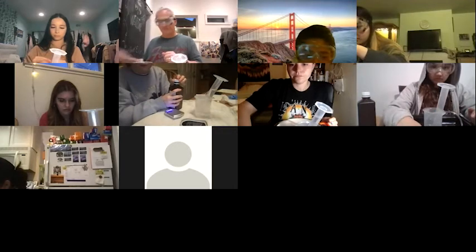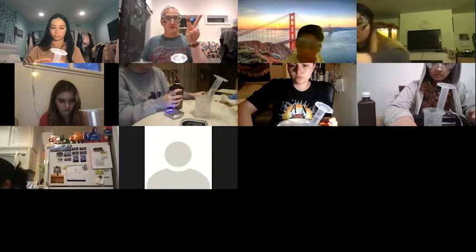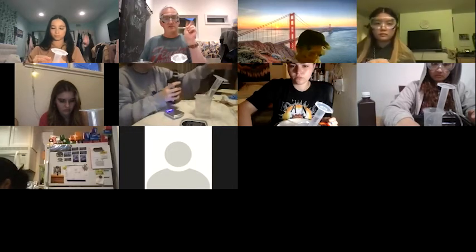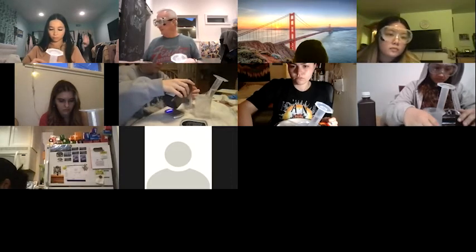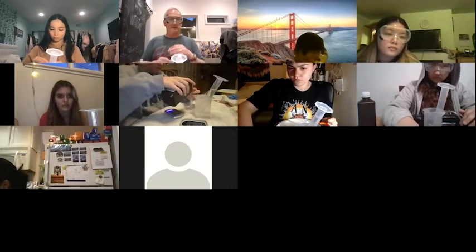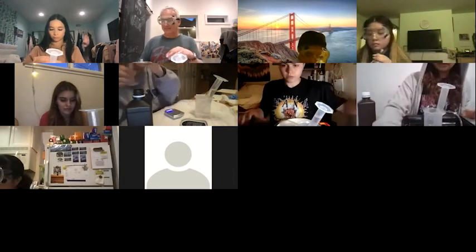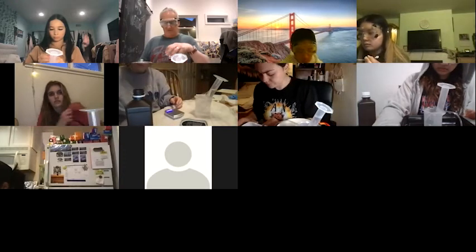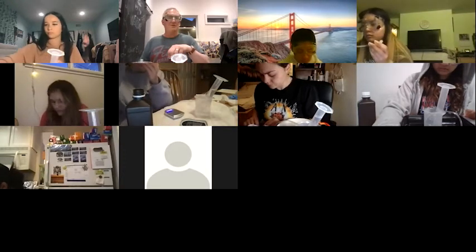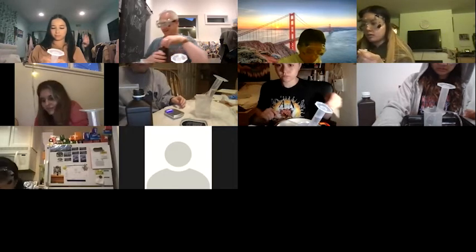Are we doing it twice for each? Doing them all twice. So do two runs with 1 mil, 2 runs with 2 mil, 2 runs with 3, 2 runs with 4, for a total of 8. But you'll see these go by really fast, since this is a catalyzed reaction. It should take maybe a minute or 2 minutes for each run. Mostly the time will be spent cleaning up the mess afterwards.